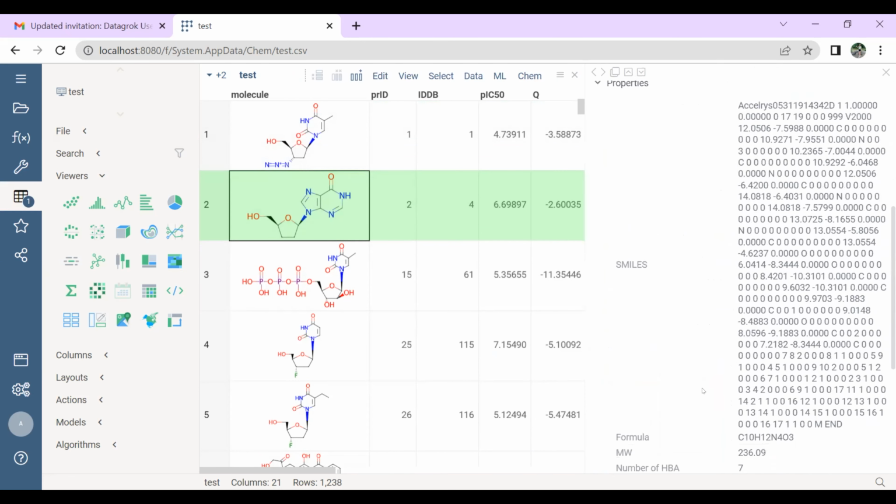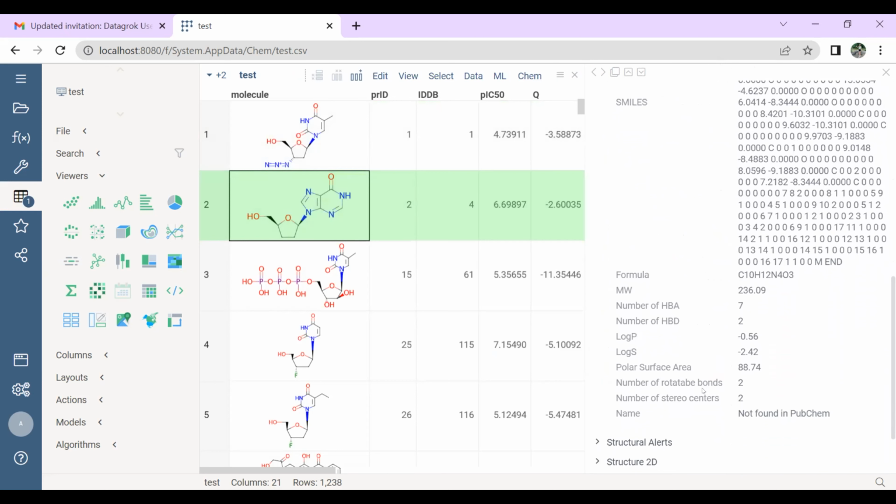Yeah, that's what would be nice, to be able to create a column with all those formulas. Yeah, I get your point. I'm pretty sure we have a way to do it in the UI already too, but let's not try to find it. Just, not to click on every row and get this formula, just to have it in one column and to scroll. And maybe even all other properties that you have over here, like molecular weight, number of hydrogen bond acceptors, donors, etc., shown as columns, to quickly add columns containing this information, because this is actually useful information.